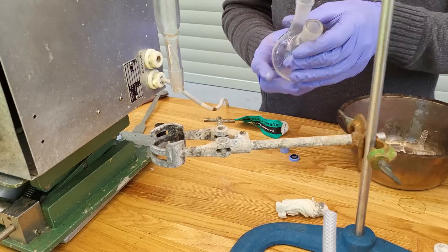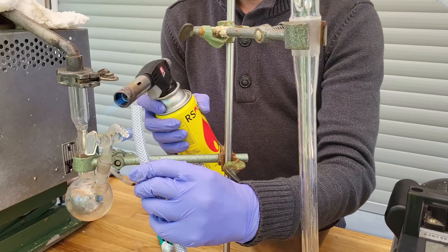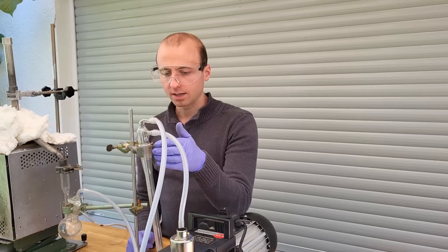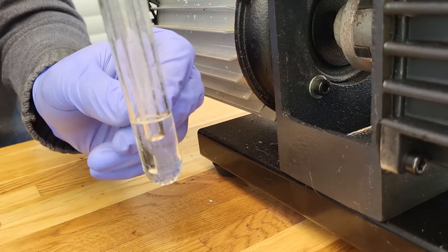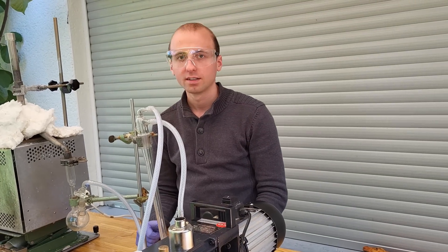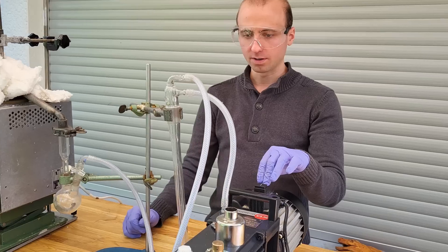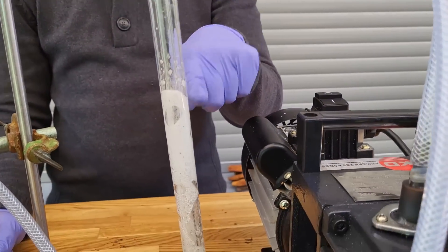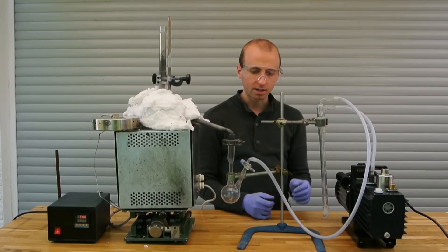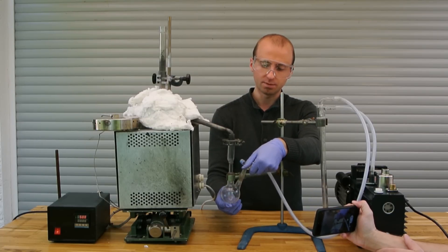The setup is now complete. Additionally I've added a trap right here, filled with a little bit of mineral oil, to hopefully catch any carbon that becomes airborne so it won't get into the pump and mess up the oil — which has happened to me about three times already. Now let's turn on the pump and hope nothing goes too terribly wrong. It has calmed down and now I can start to carefully and slowly evacuate this apparatus.